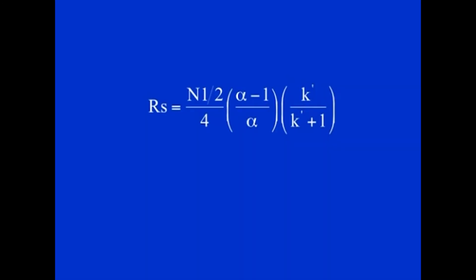So, the three things which are important, like we said, selectivity, efficiency and capacity are very important, and resolution is related to capacity ratio, relative retention ratio and plate number by this particular equation. This is n half, that is superscript, and this is selectivity factor, and this is the capacity factor taken into account to calculate how the resolution is related to these factors.